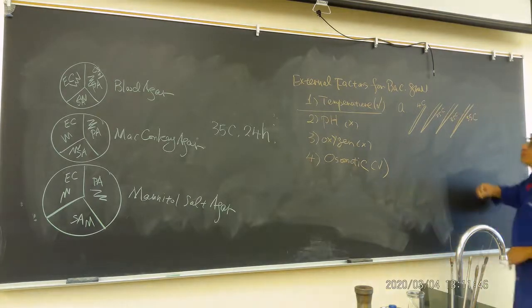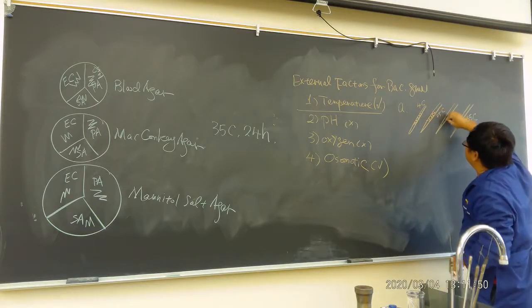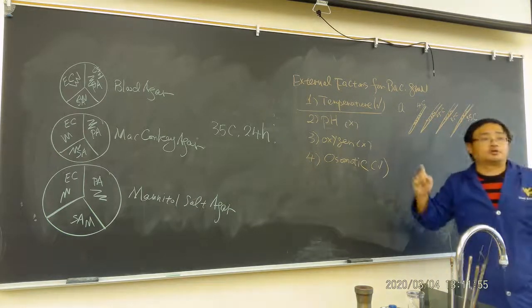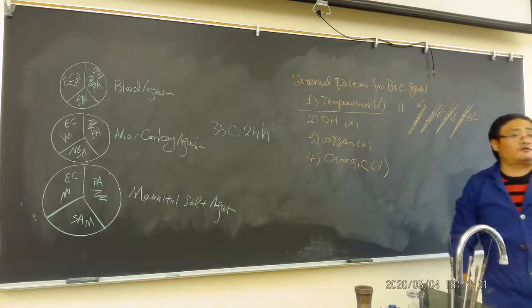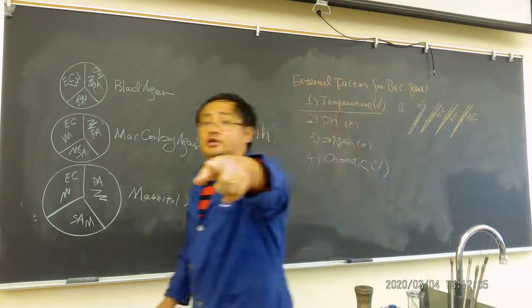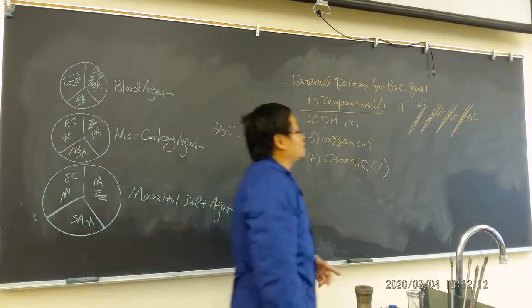Then you will inoculate, do a zigzag streak of your assigned culture. So let's do assignment. You guys will do E. coli. You guys do Staphylococcus aureus. You guys will do Pseudomonas. You guys will do Bacillus. Only one assigned culture, we will share the results, okay?